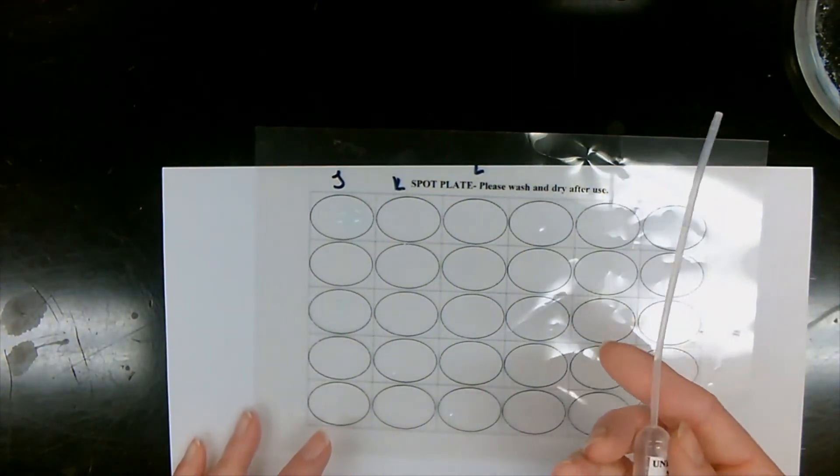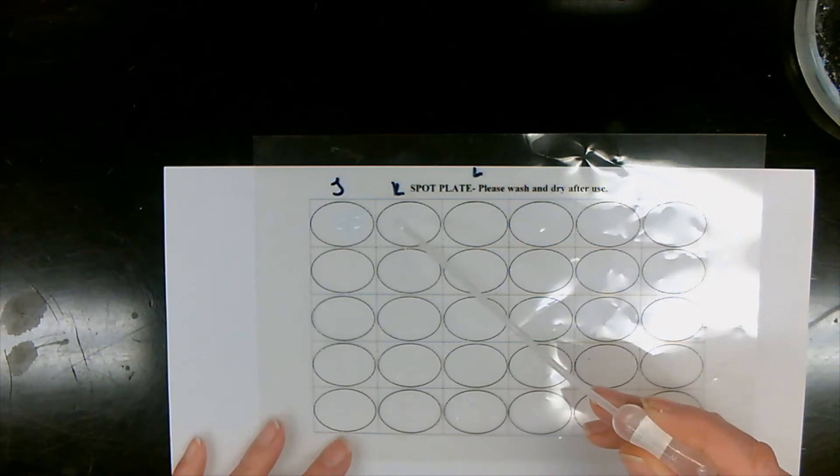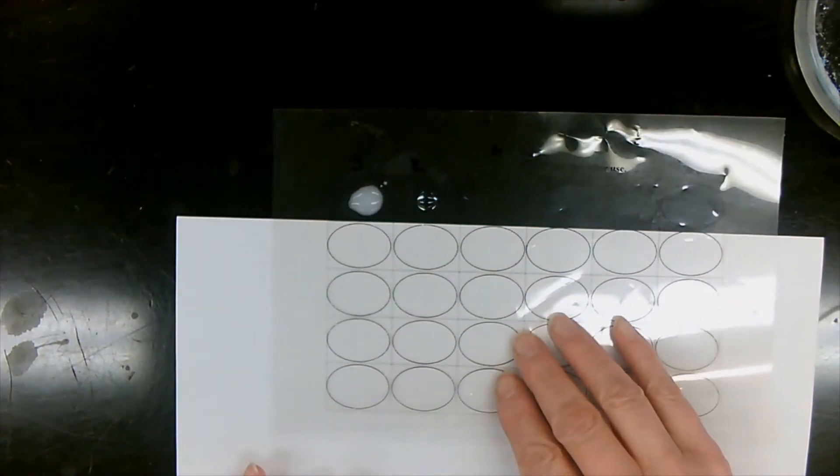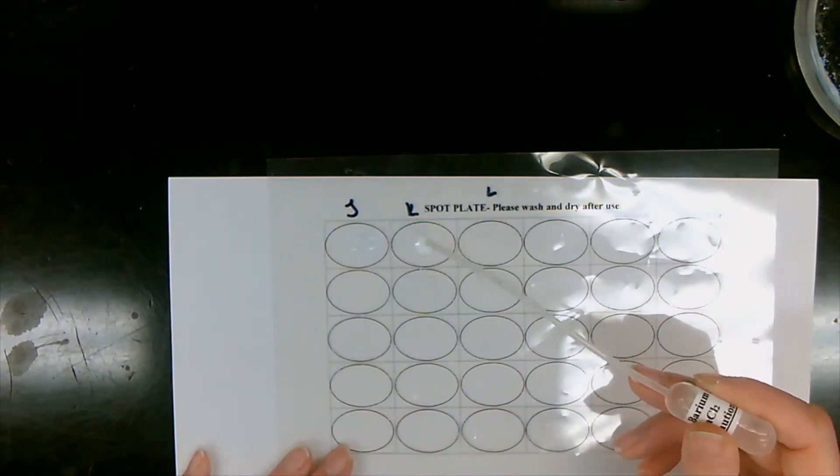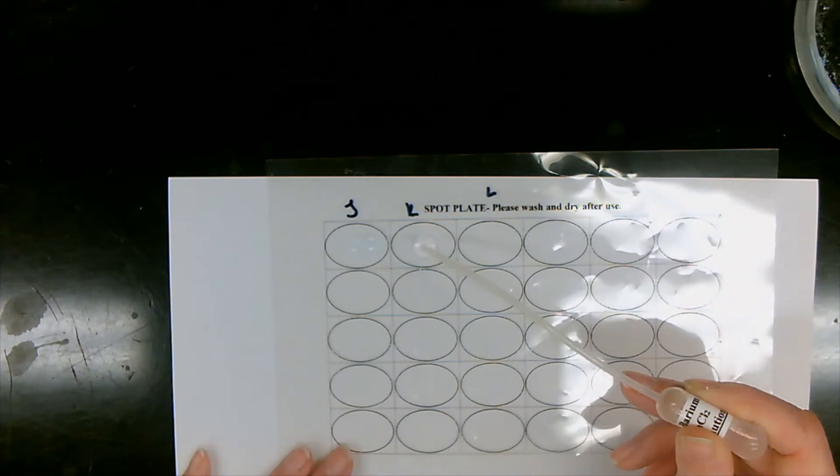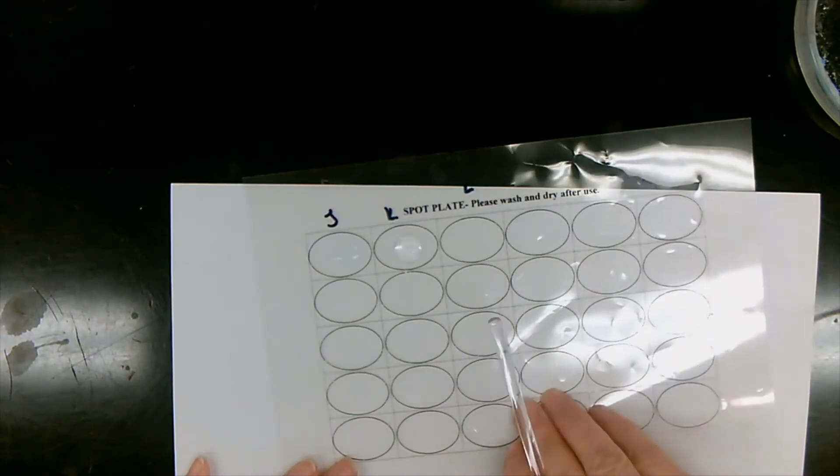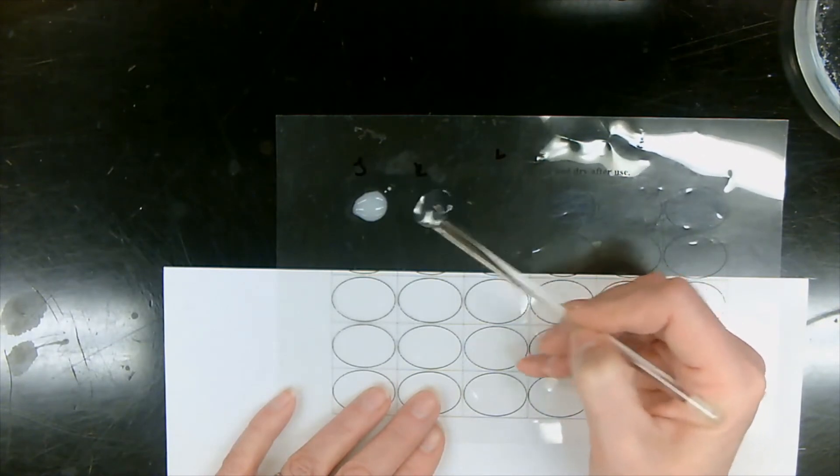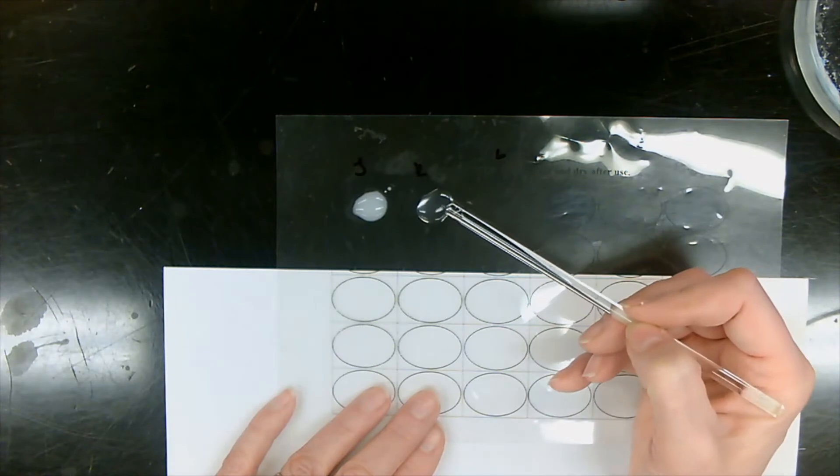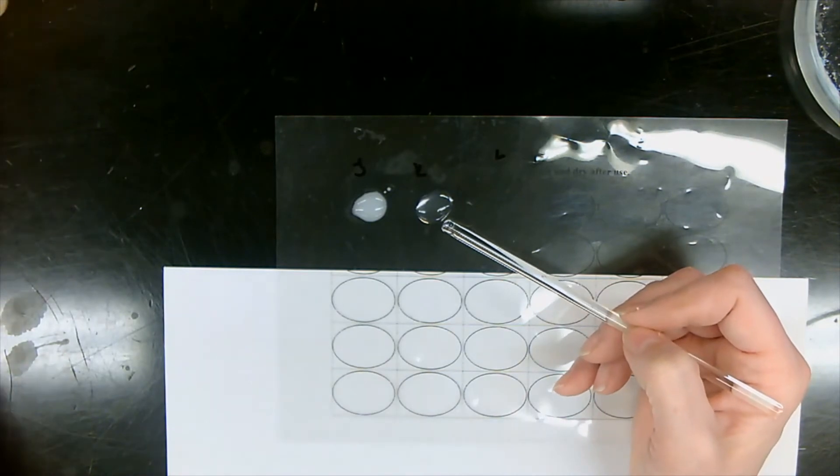And now let's move on to K. Unknown salt K. Three drops of K. So we can see it's clear. Adding our barium chloride. Three drops. Black background. Still stays clear, no change, no precipitate.